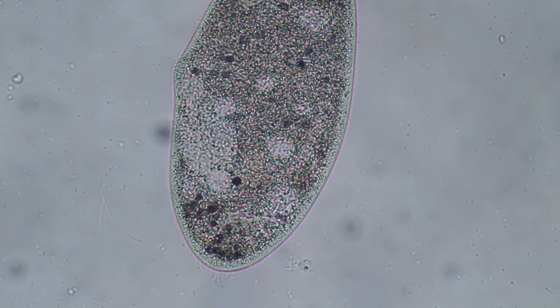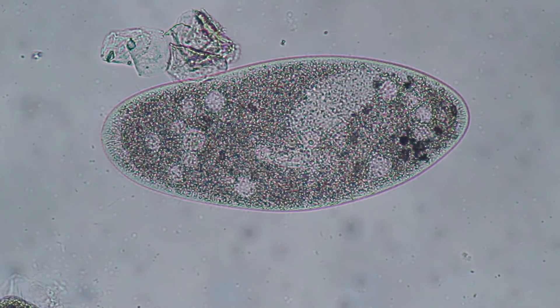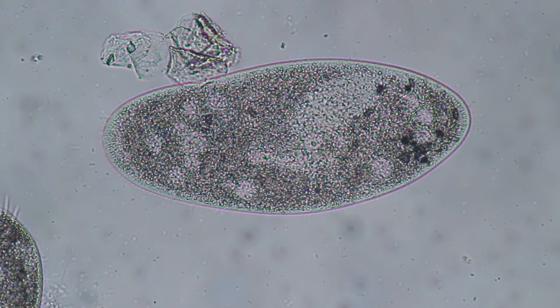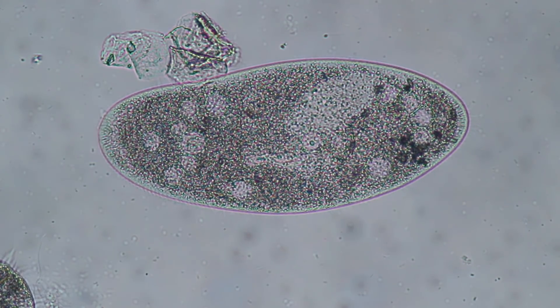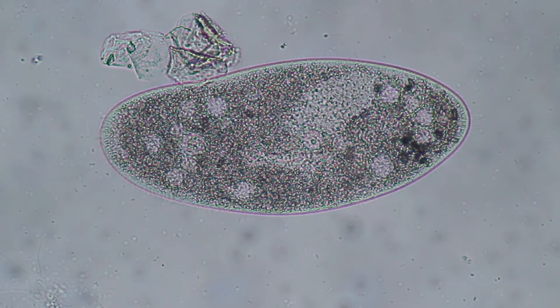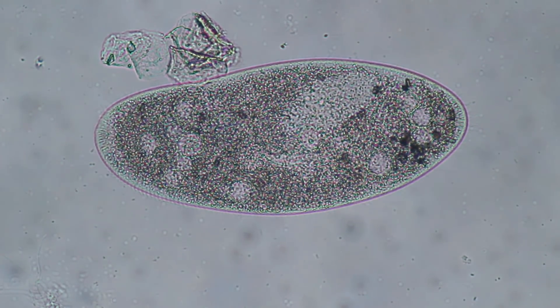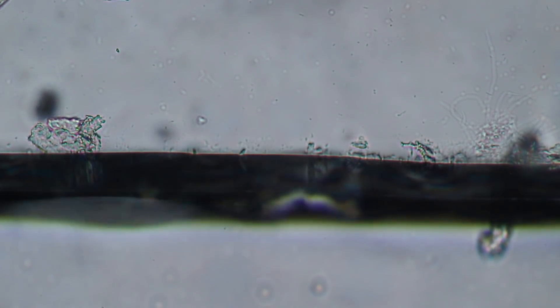Brightfield microscope — pressed flat already a little bit because it does not move around so quickly, so it's a little bit limited in its movement. But you can see that the cell organelles are all happily moving around. If you look very carefully, you can also see the surface of the cell. There are little cilia — the little hairs — they're beating.